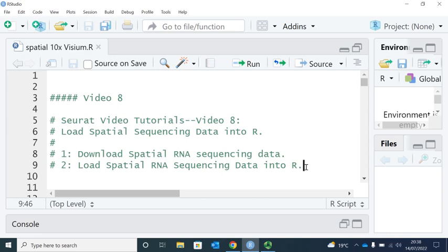Spatial RNA sequencing is the next generation molecular profiling solution to understand not only the gene expression profile, but also the cell location in the tissue and the cell types of their surrounding cells.